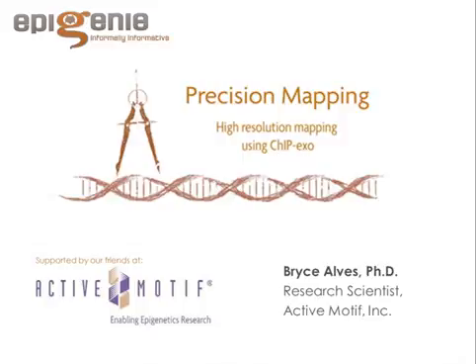But since we want these adapters to simply land on either side of the blunt-ended DNA that we already have, it doesn't really matter if you have directional, since they're the exact same adapters, just in mirror image from one another on either side. Okay.